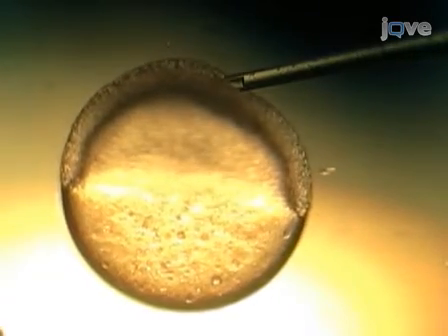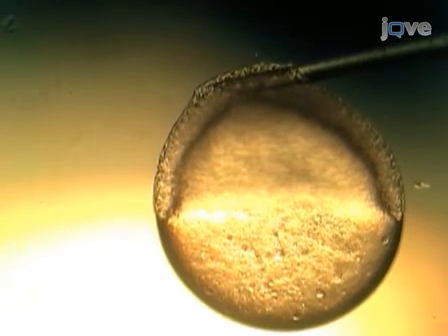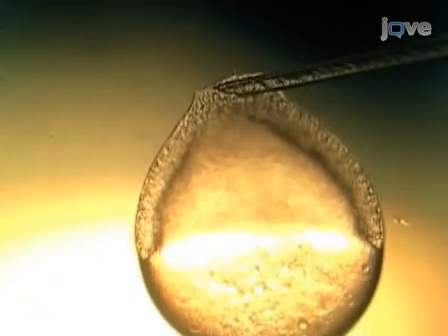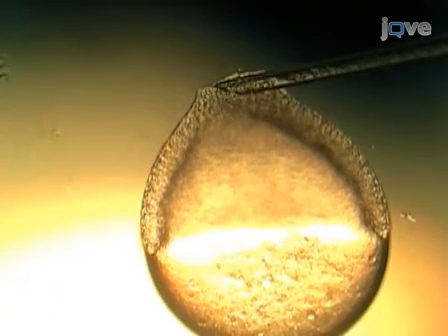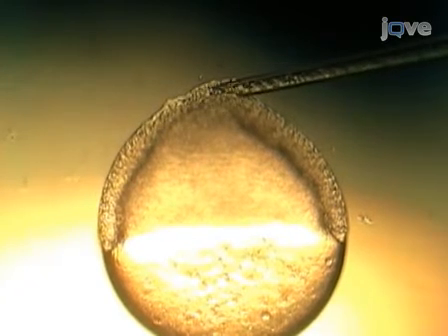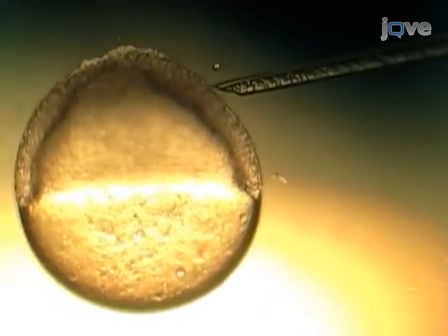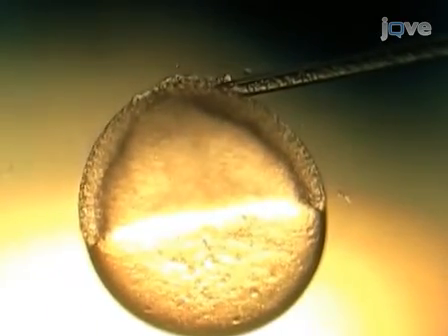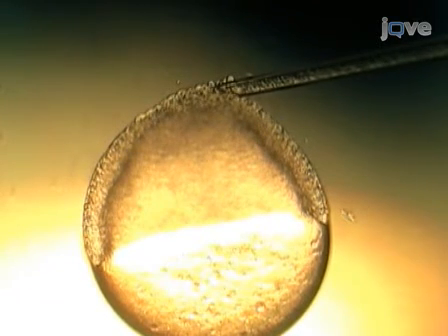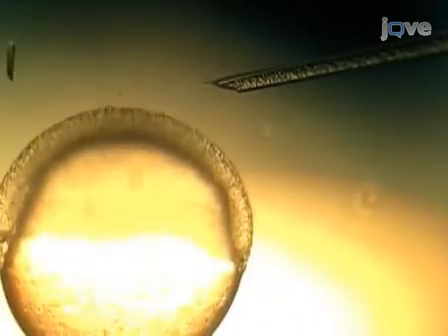If it is mounted properly, it will not roll as the transplantation needle enters, unless the embryo is too old to allow the needle to penetrate easily. To avoid piercing the yolk, the needle should enter the embryo at a focal plane that is just slightly deeper than that of the EVL. Once pierced, a large number of cells can be removed from the donor, for up to 3 host cell injections. When drawing up cells, avoid sucking up the yolk by moving the needle around as the cells are taken up.